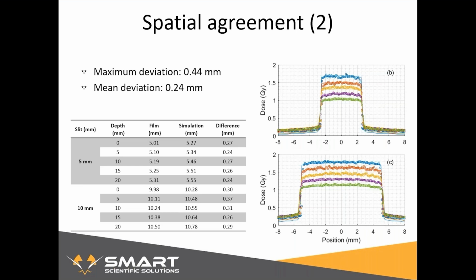non-image guided applications. We assume that the slight deviations are usually caused by differences in positioning, because you don't have a real reference point, and the voxelization within SmartRAD, because when you're combining all those geometries and giving it to the Monte Carlo engine, it needs to pick a resolution, which here was 0.3 millimeter, and you get slight shifts in positions, but acceptable in this case. I will not go further into all the other results, but you're free to read the paper once it's published in Physics in Medicine and Biology.